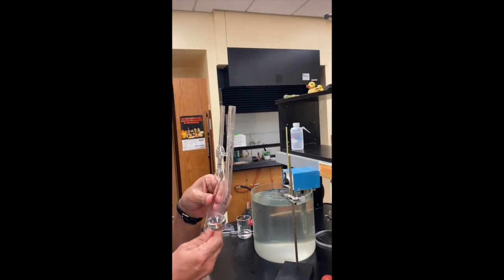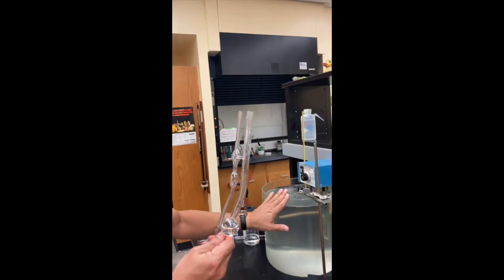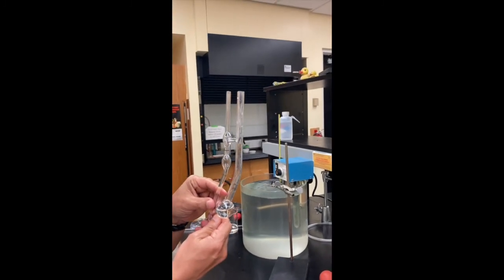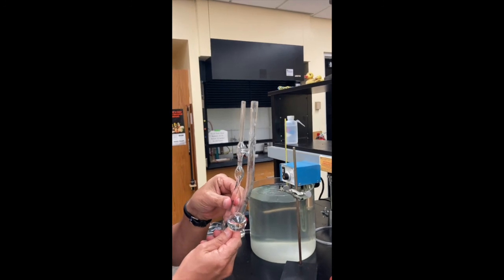So the key factors for the success of this experiment: first, maintaining constant temperature; second, keeping the viscosimeter clean, rinsing with acetone between every measurement.